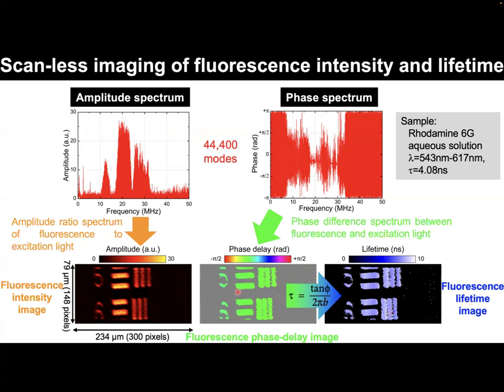So the test pattern was clearly confirmed in these three images. However, the image contrast mechanism is different among them: the fluorescence intensity, fluorescence phase delay, and fluorescence lifetime. The lifetime value of this image is in good agreement with the literature value of this sample.